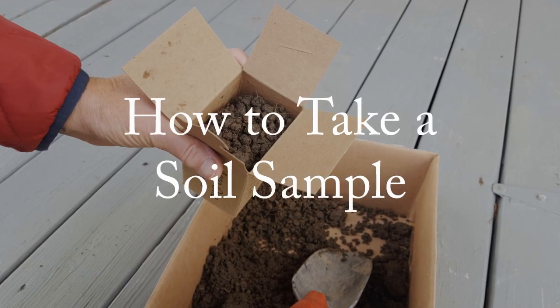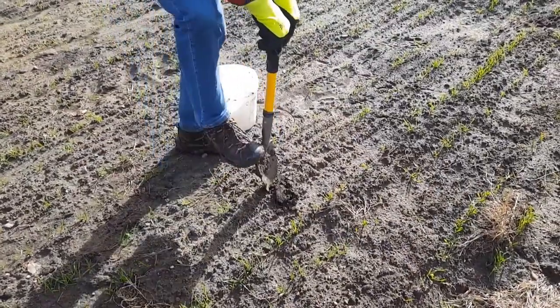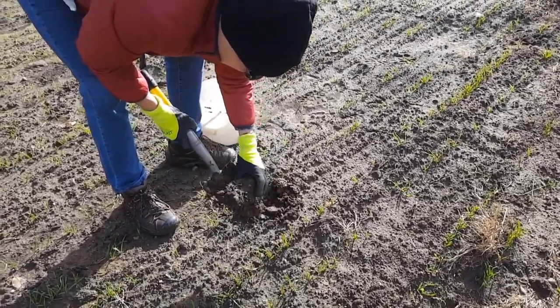This video will demonstrate how to take a soil sample. Your test results are only as good as the sample you submit, so it's important to take a representative composite sample consisting of several subsamples.